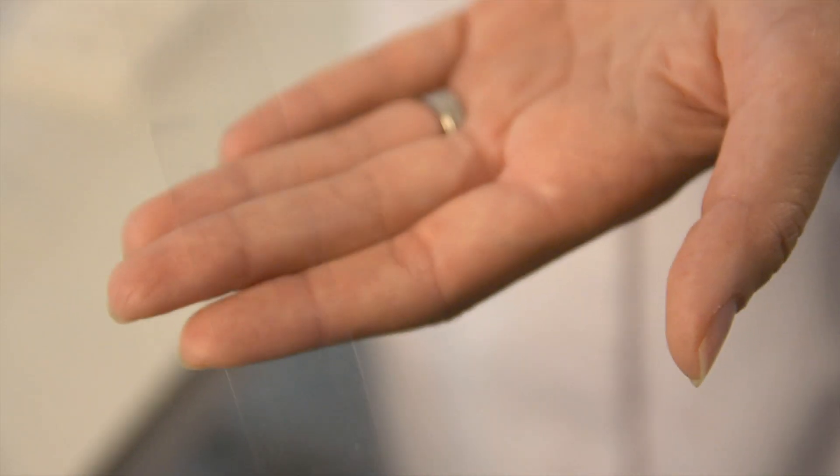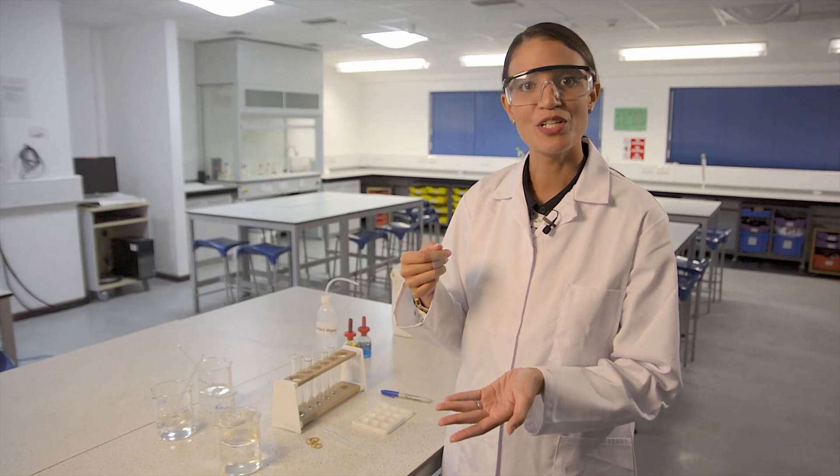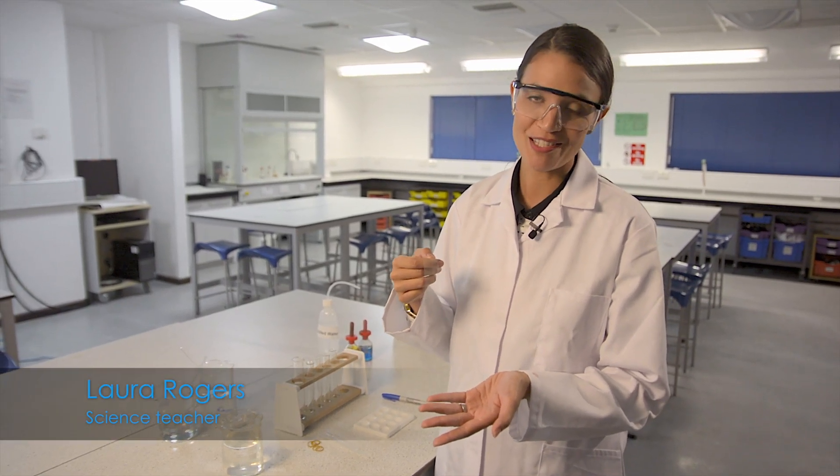This is visking tubing. It's long been used in school biology practicals. It's semi-permeable, which makes it useful as a model of the human gut, which is what I'm going to show you in this demonstration.